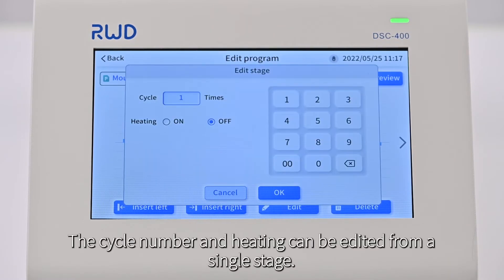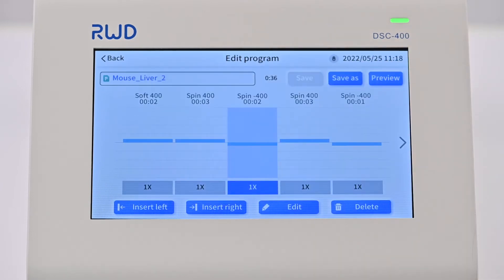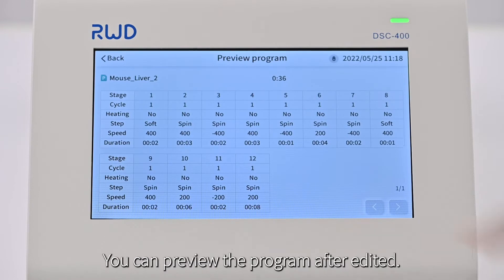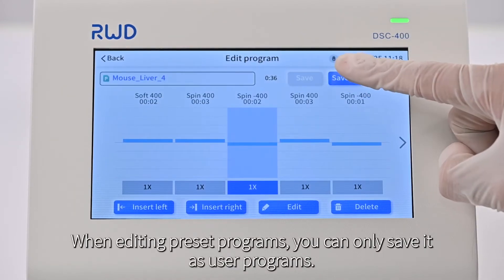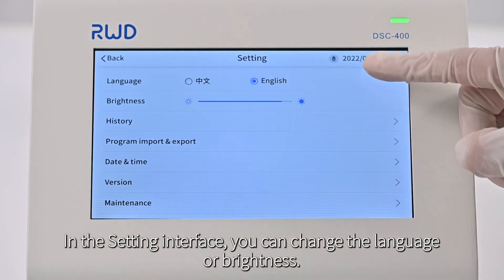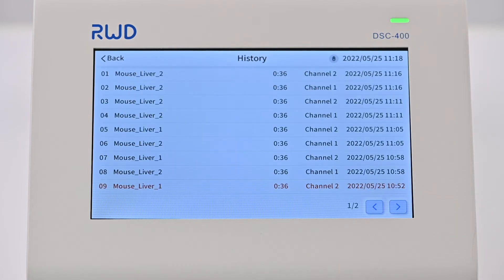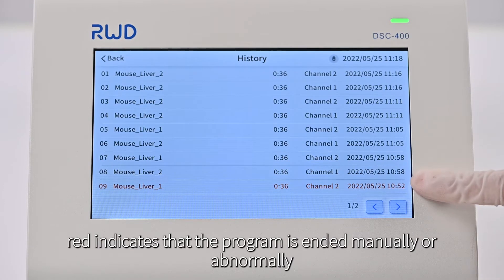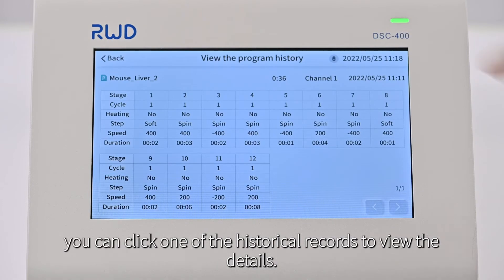The cycle number and heating can be edited from a single stage. In the history interface, red indicates that the program ended manually or abnormally, black indicates it ended normally, and green indicates the program is running. You can click one of the historical records to view the details.